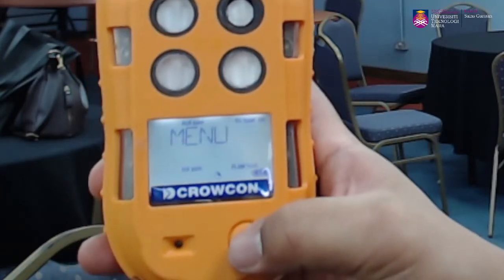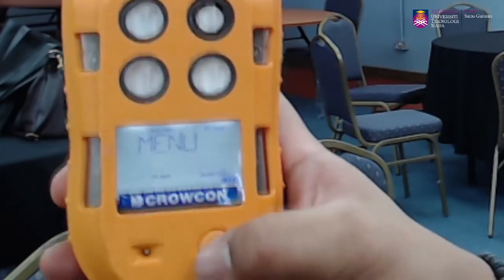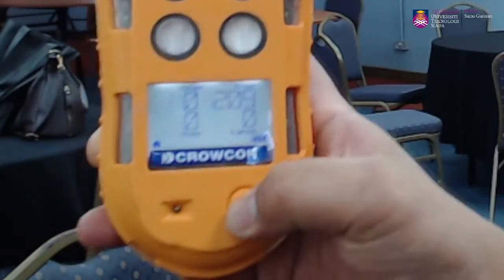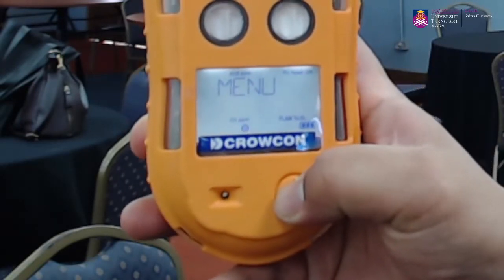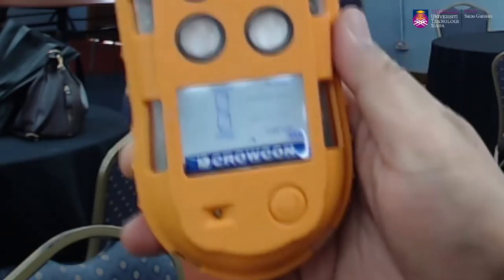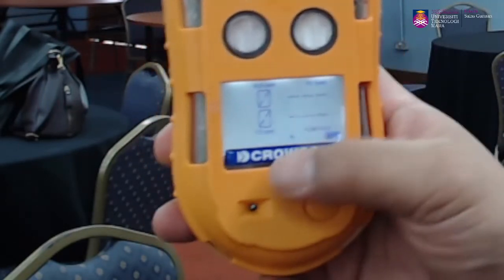It runs on the normal screen. This is STL, where we look at 15 minutes. If we want to select STL, okay, let me do it once more. Menu, double click, then press one by one until you reach the STL symbol. Double click again. Then it will show us STL, and the menu at the bottom is not blinking, which means we have selected that one.